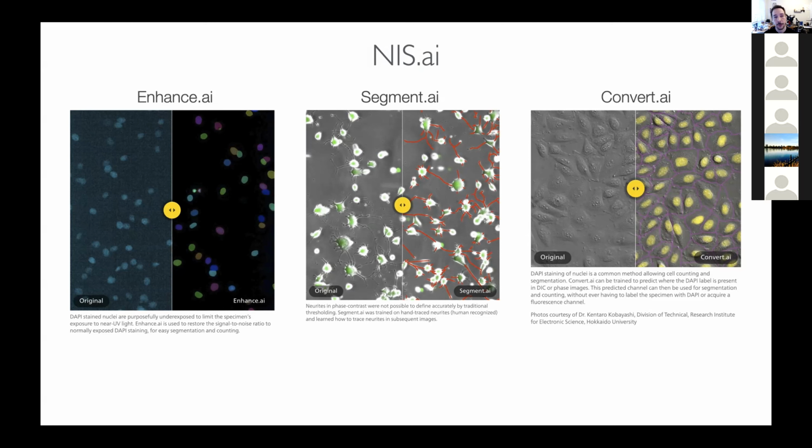What people have done is train the network so that when it sees that plasma membrane marker, it knows where the nucleus should be, and it will place the nucleus in that image so that you can use that as a seed to detect the cell. So if you're hitting a wall and your conventional analysis is just not working for you, come back to this and think about employing these tools. This is something that we can definitely help you with in the platform. And hopefully after today, you'll be a little bit more comfortable even approaching that yourself.